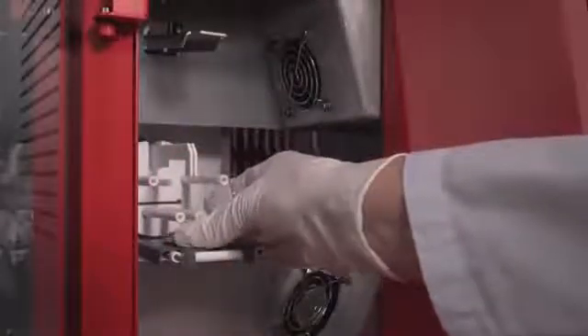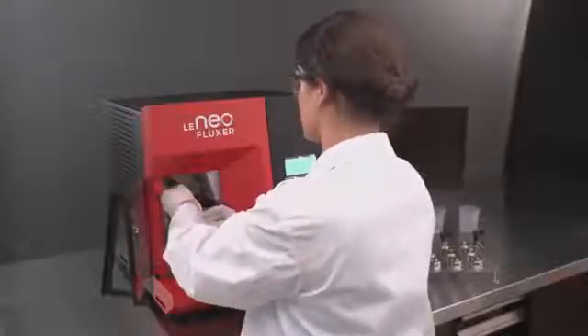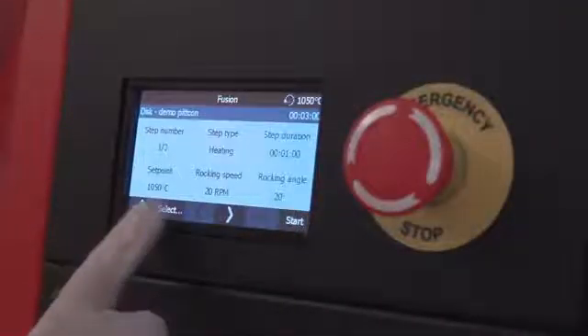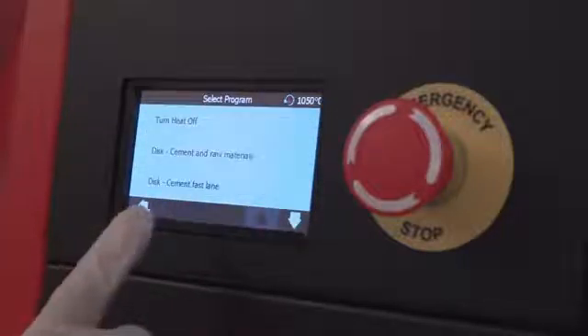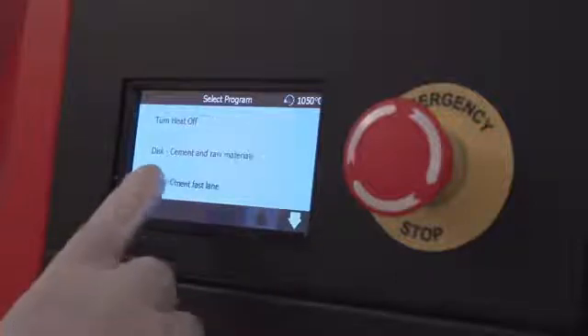The operator places the platinum mold, installs the platinum crucible containing the appropriate fusion mixture, closes the instrument's door, and selects the appropriate fusion program. Ten preset fusion programs have already been developed by Claes Fusion experts.